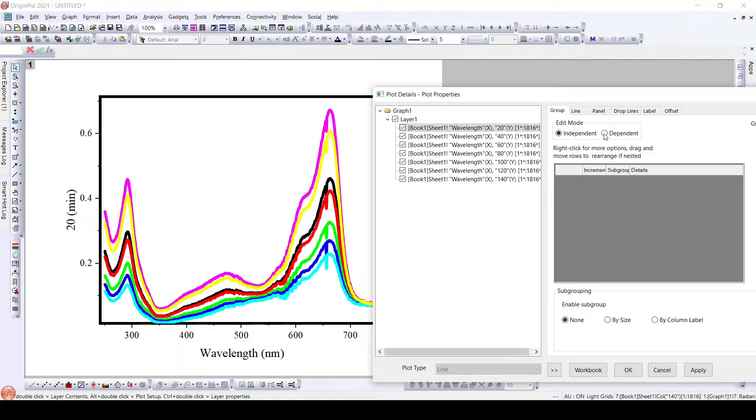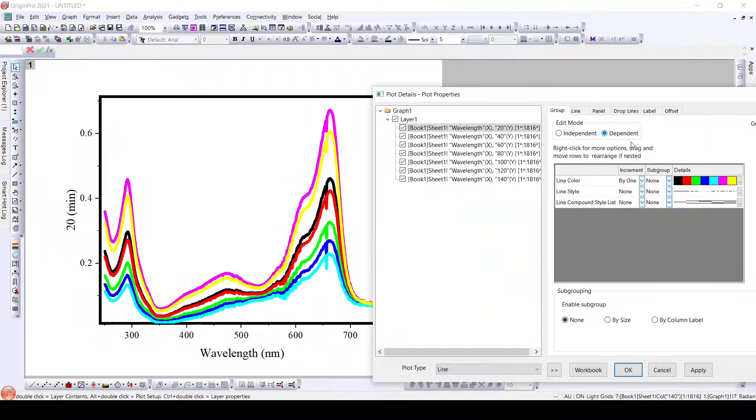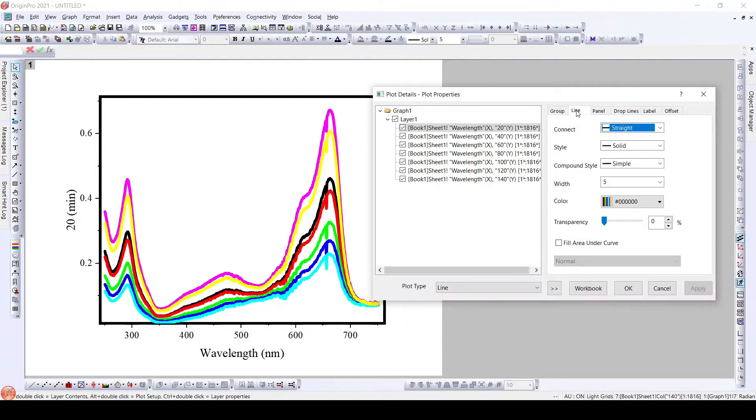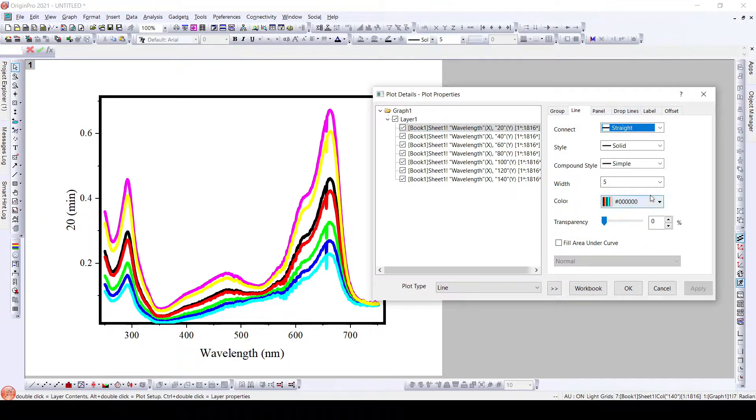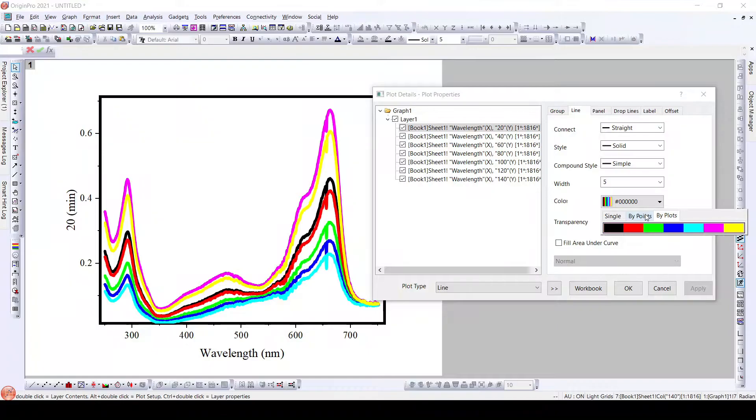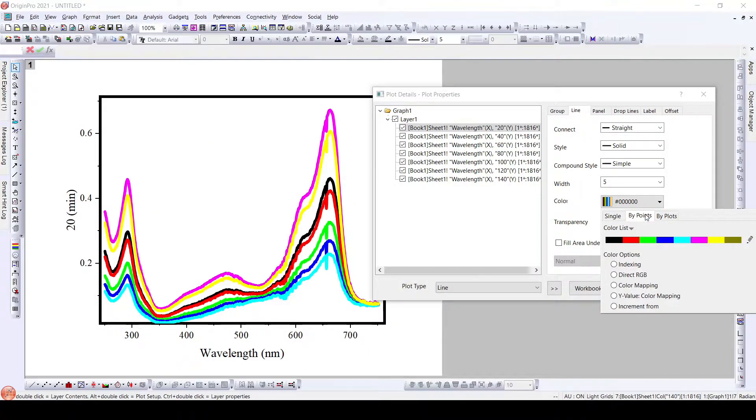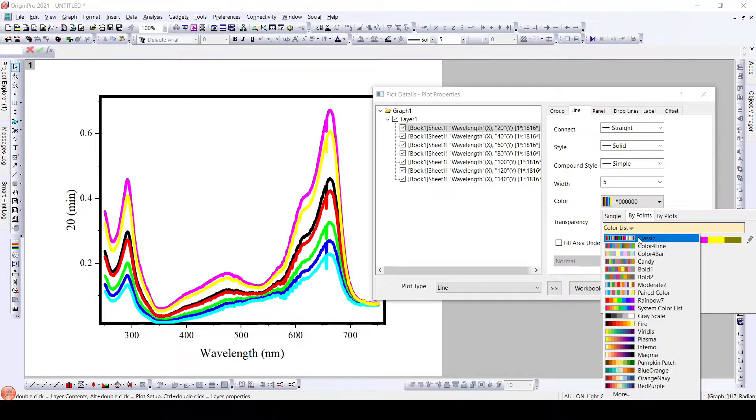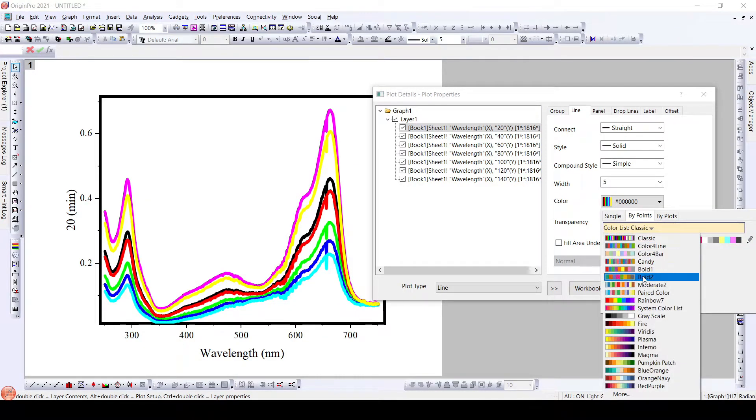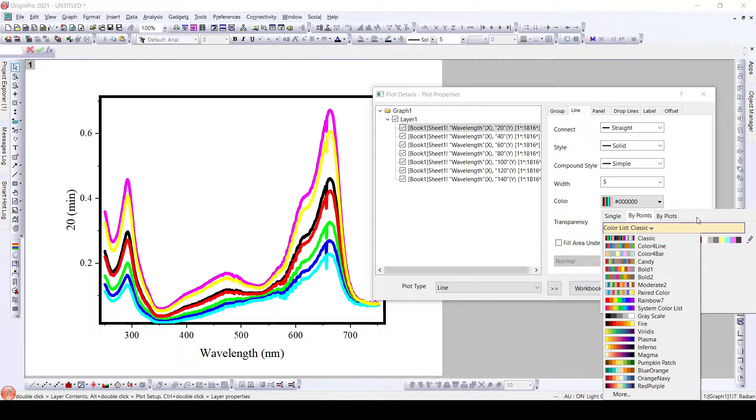So for this what we need to do is we will go to line here and we will go to color by points. When we go here, we can see a color list which is either classic or we can have different colors that are available here.